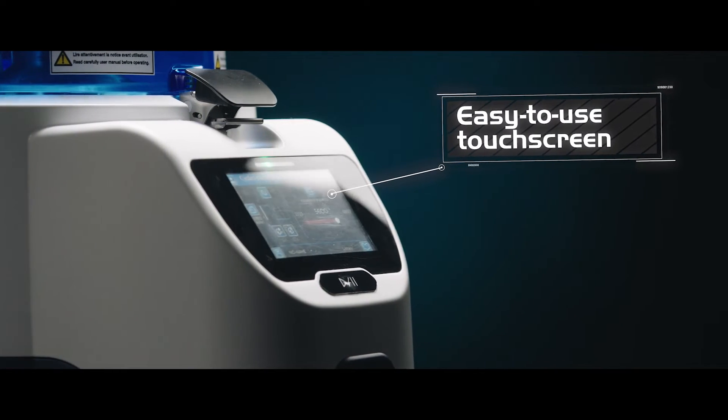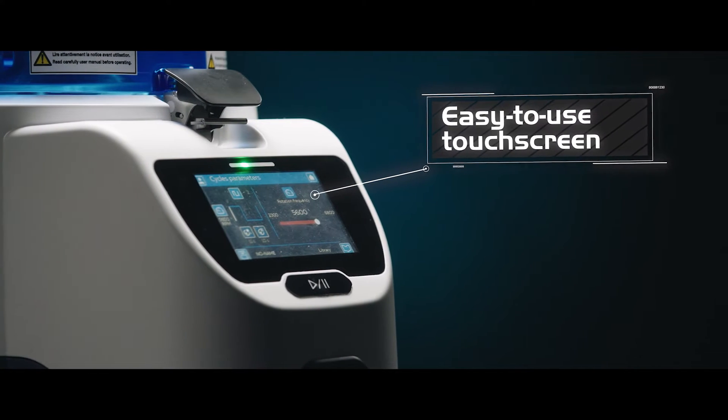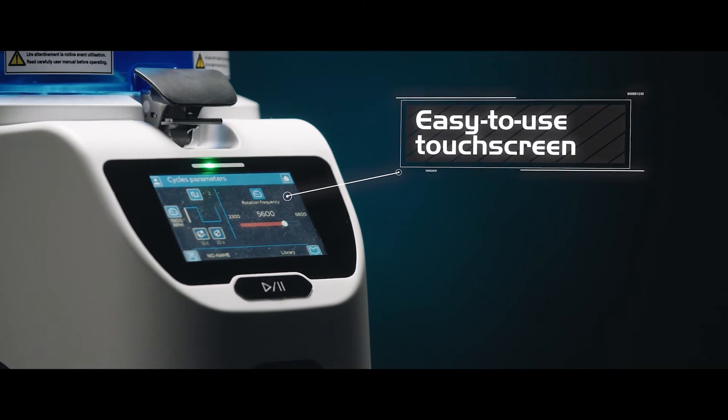Safe and very easy to use, its touchscreen technology is compatible with constrained environments.